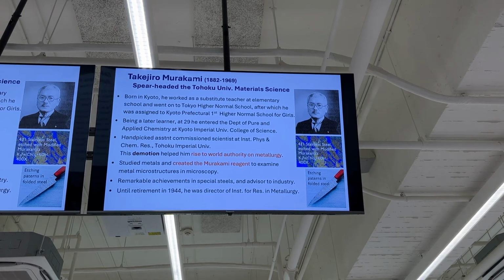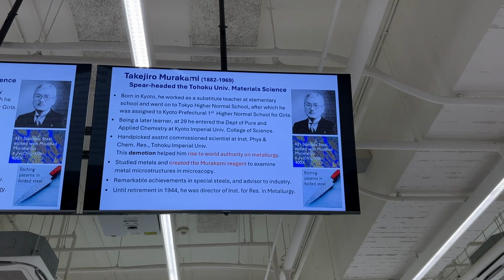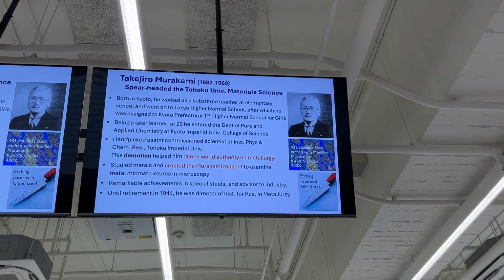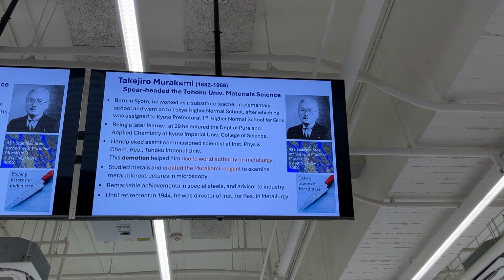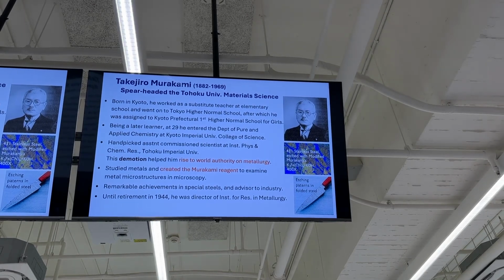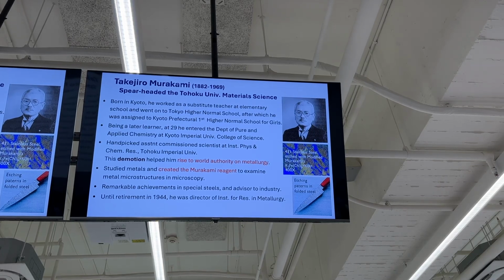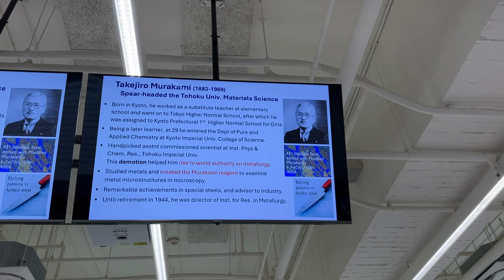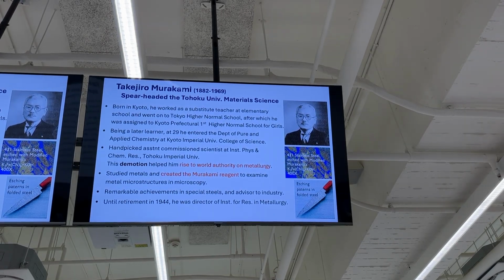So, if in your undergraduate classes you have looked in a metallographic light optical microscope, you need to see such patterns, and that is a steel that is etched with a modified Murakami solution of the sort that we are using. Also, you see the potassium hydroxide, so it's basic. The Damascus steel, it's a lot of folding, but we bring out the pattern extra well with the dip of etching in this solution.